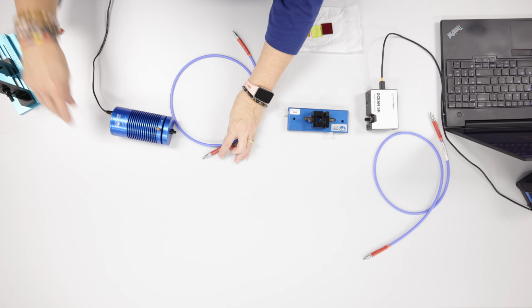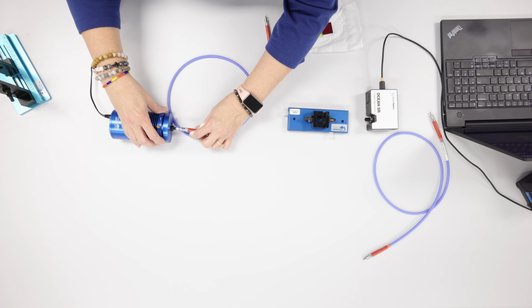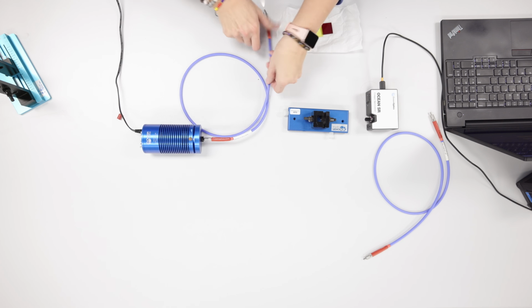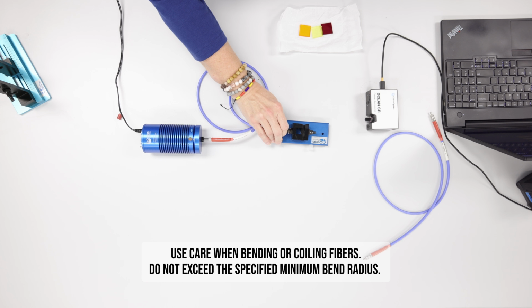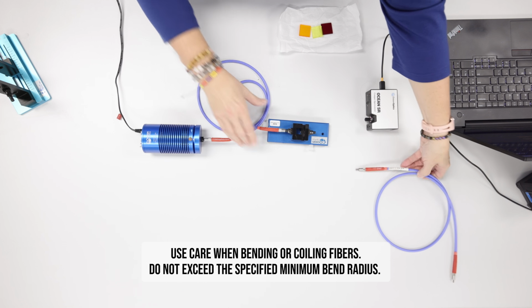Turn my light source on. And we're going to connect it up very similar to how we did for absorbance because we're passing light through the sample. In both cases, we're passing light through, but in this case, we're looking at the light that comes through the sample, that actually makes it through.